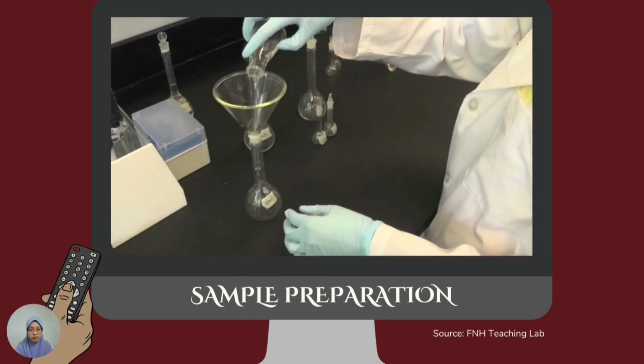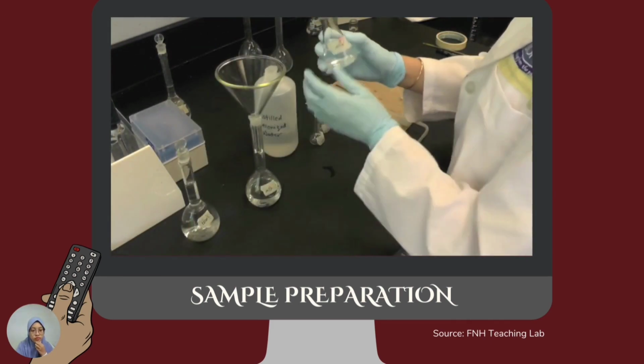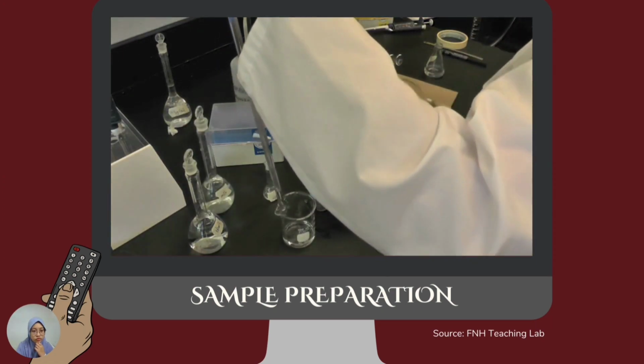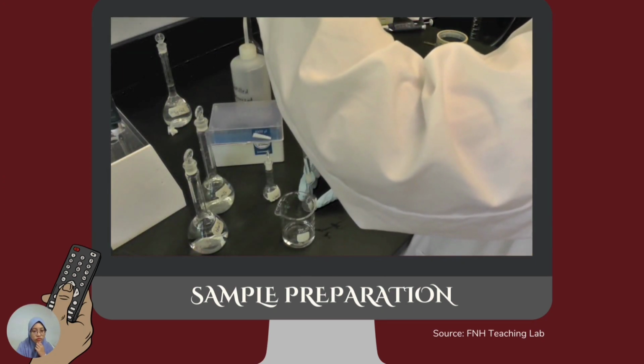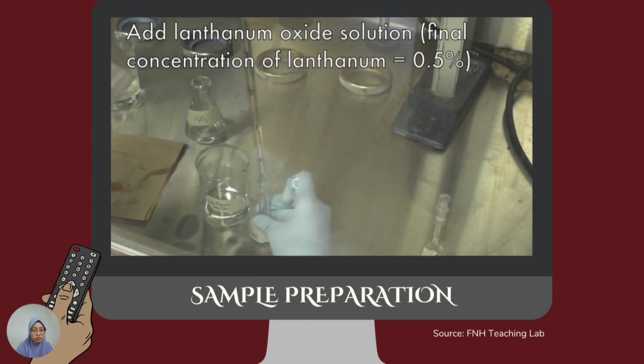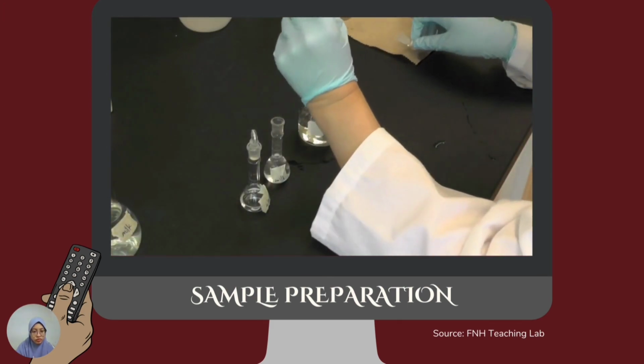After heating, transfer the samples and blank separately into 100 milliliter volumetric flasks. Rinse each Erlenmeyer flask with DD water and add it to the volumetric flask, then make up to volume. Invert a few times to mix. Next, pipette 1.0 milliliter of each sample or blank to the corresponding 10 milliliter volumetric flask. Add the appropriate volume of 2.5% lanthanum oxide solution to each flask to obtain a 0.5% final concentration, and make up to volume with DD water. Invert a few times to mix.